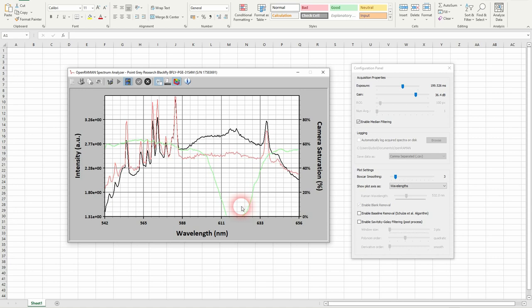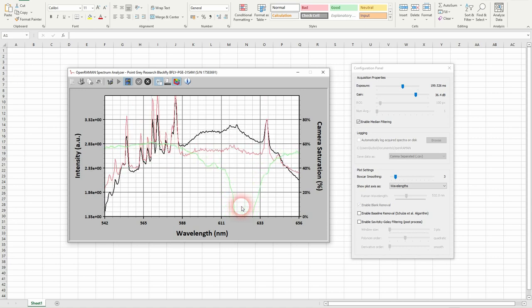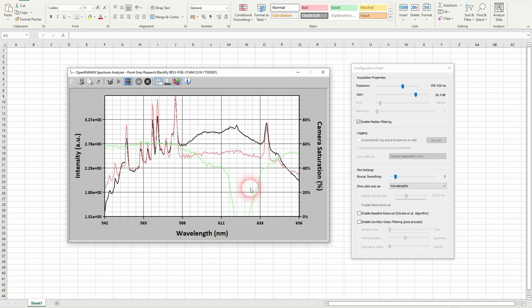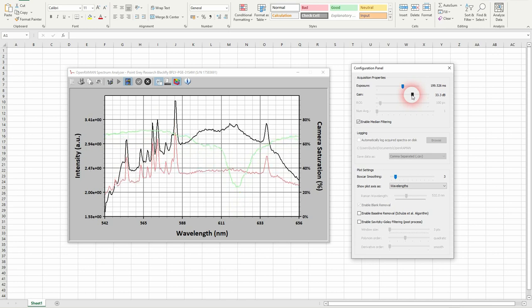That's perfect. So that's about the maximum that I can do. And you see that it's actually already a little bit too much.